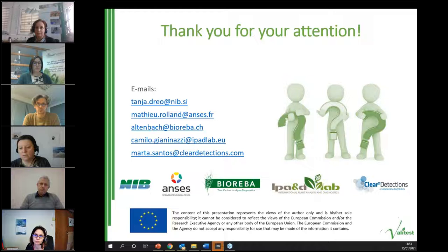So there is a hand raised from Valérie Guimot. So Valérie, you can take the floor if you want to ask your question. I was just curious to know the analytical sensitivity of the kit for the detection of Ditylenchus.